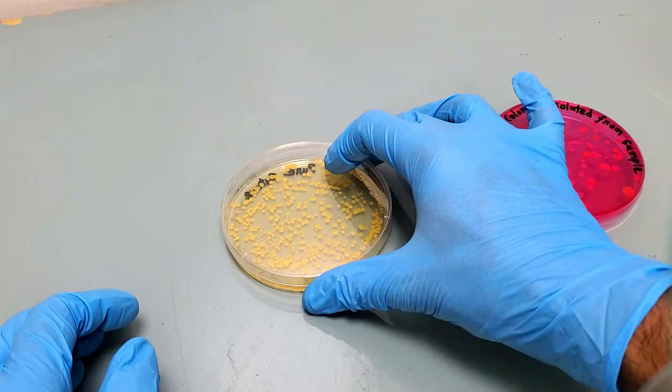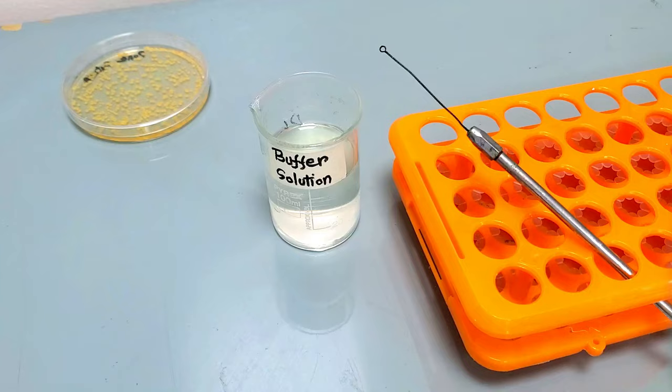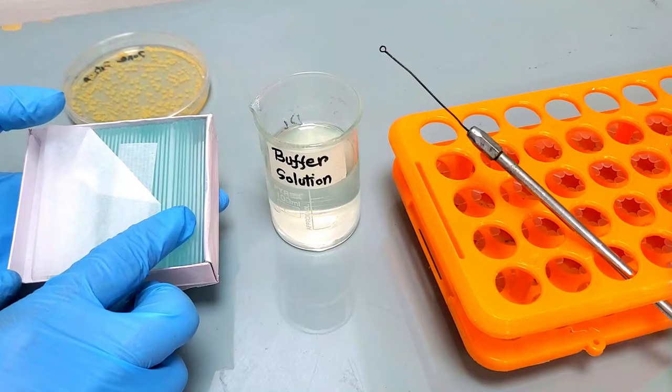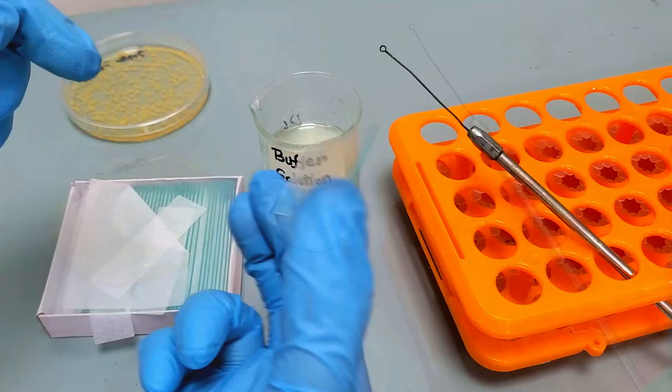Now we will prepare bacterial smear on a microscopic glass slide. For the preparation of bacterial smear, we need a pure culture of bacteria, buffer solution, inoculating loop, clean microscopic glass slide, and Bunsen burner.